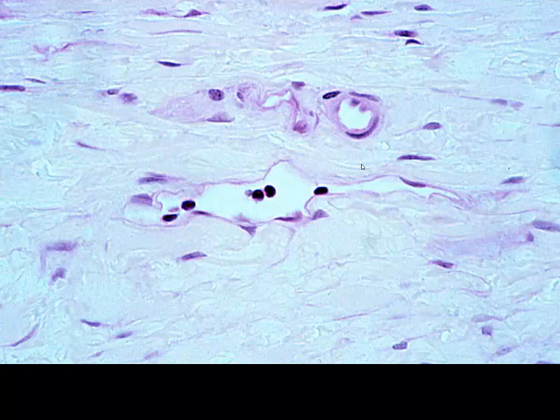Once again, here we have some small vessels. We have an arteriole, with that one smooth muscle cell around and endothelium on the inside, and possibly a venule that is collapsed here. But in this case, we see white blood cells and no red blood cells in this fairly elongated, only endothelium, so this is going to be our lymphatic vessel.